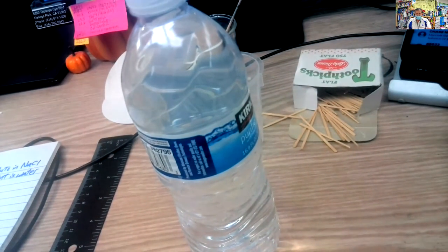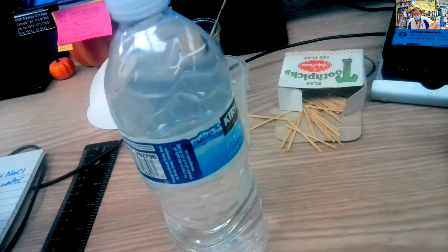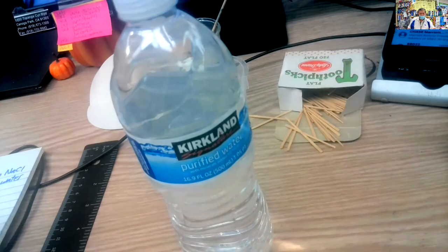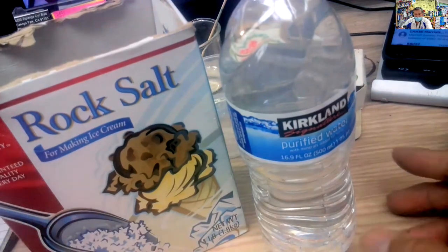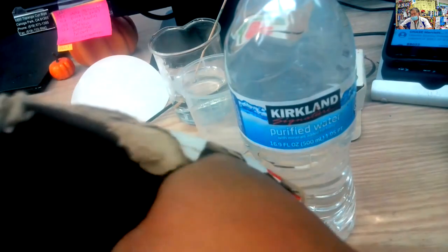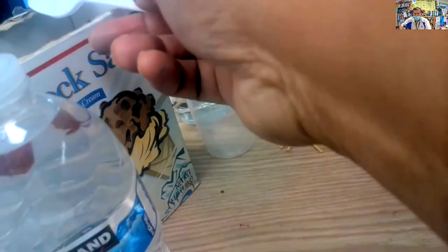I need to mention, because most of you don't have an electronic balance, you can make the salt solution with just the bottled water. It's about a teaspoon in 2 cups of water. So that's like a water bottle with, and here's the salt. And so you could just take a normal spoon, a teaspoon, and get a teaspoon of salt. There's a teaspoon of salt. Again, I'm using rock salt, but that's because that's what I had. I would have used table salt if I had table salt.